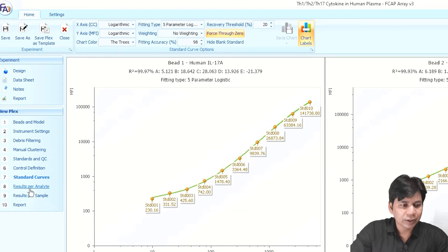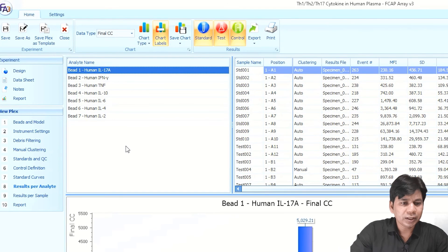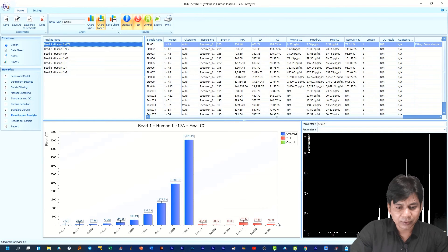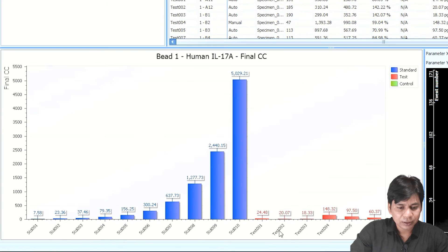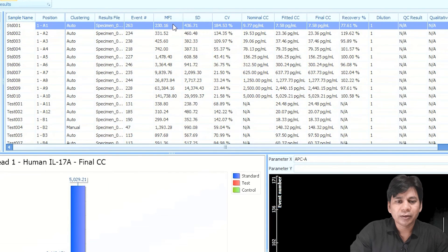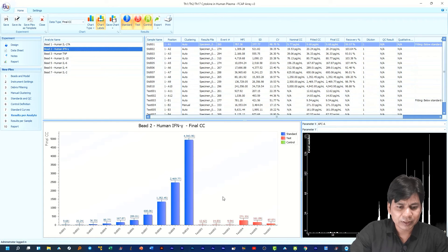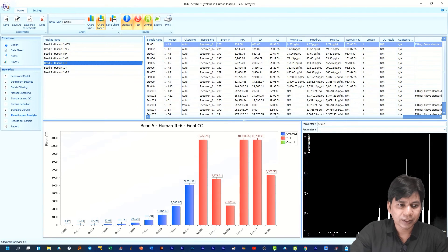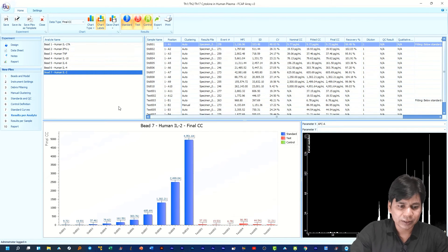After the standard curve, click on 'Result per Analyte.' In Result per Analyte you can see the results for each bead — for example, Bead 1 IL-17A shows the IL-17A results across all samples and standards. The data is shown in column format with MFI value, SD, CV, and concentration. If you click on IFN-γ, you can see the gamma results for all analytes across all samples and standards. Similarly, you can view TNF-α, IL-10, IL-6, IL-4, and IL-2 results.